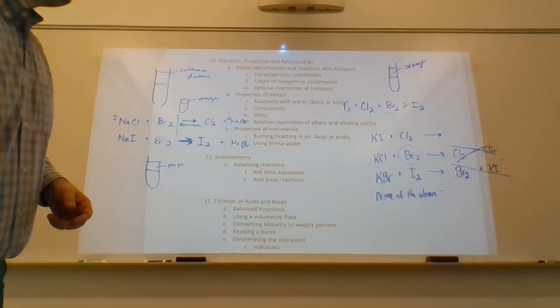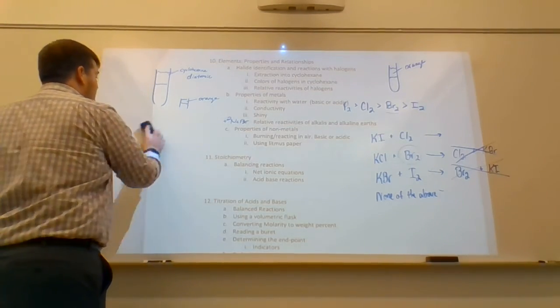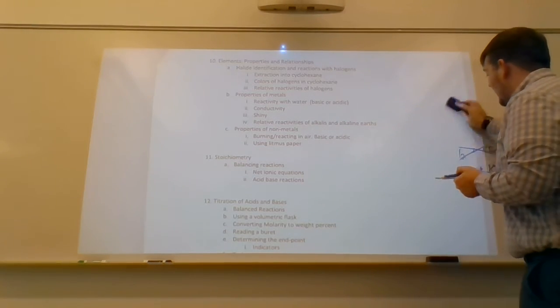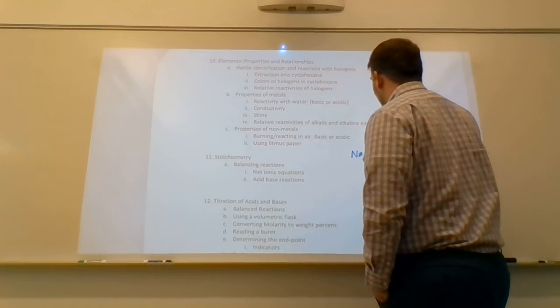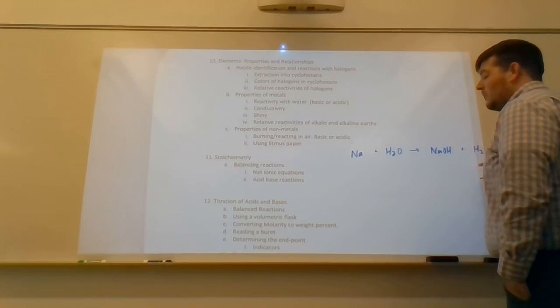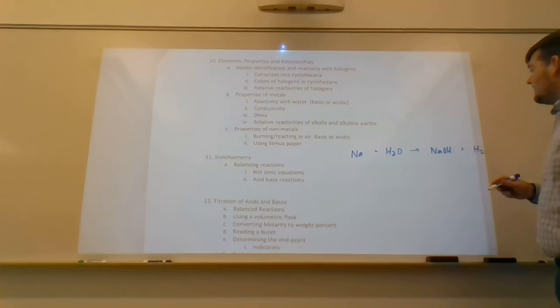It says properties of metals. Reactivity with water. So when we took an alkali metal and reacted it with water, what happened? An alkali metal, aka like sodium. When we took sodium and reacted it with water, what happened? Yeah, so this was pretty reactive. This is the demonstration that I did. We saw that it caught on fire. Why? Well, it was making H2 gas, and the H2 gas is flammable, right? And it's an exothermic reaction. That's why we saw that smoke coming up. All right, so based upon this information, by the way, it's not balanced.